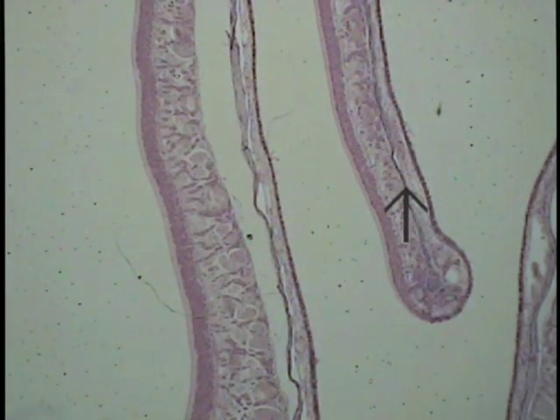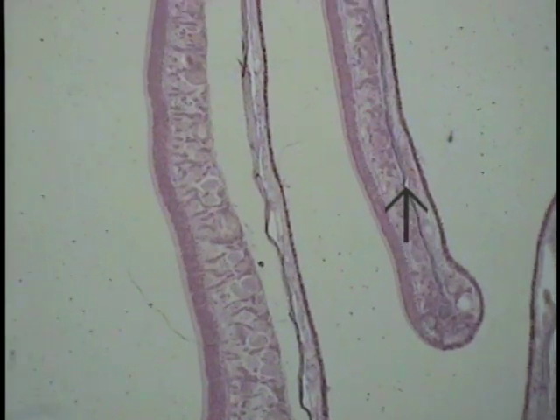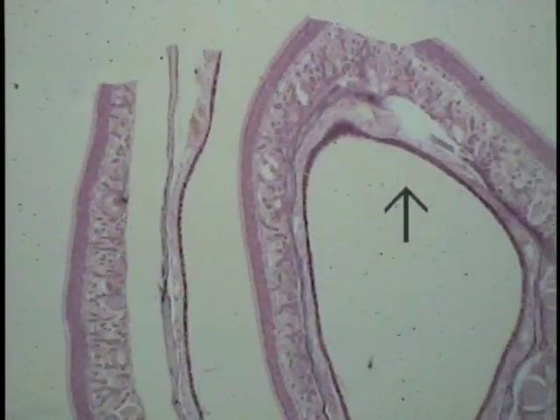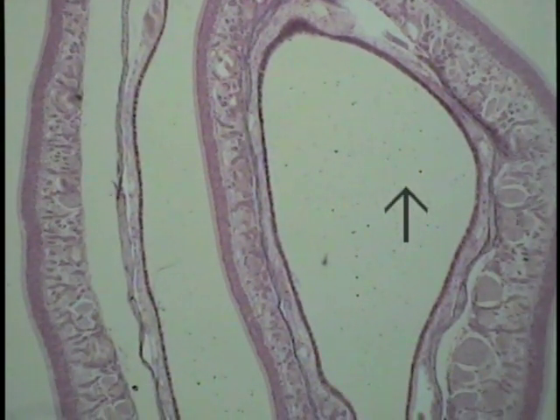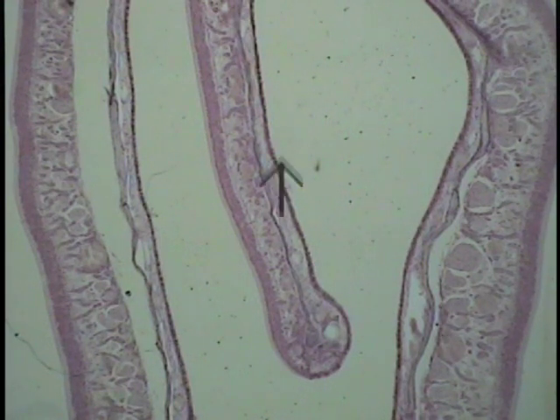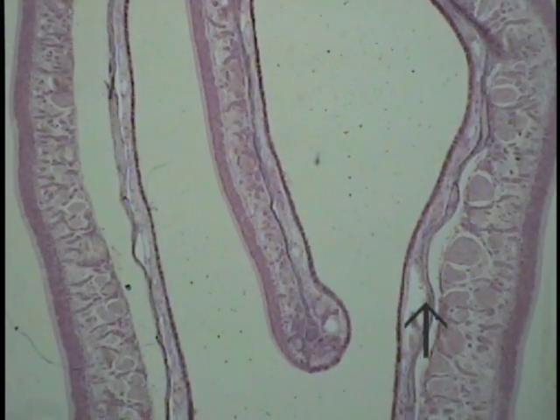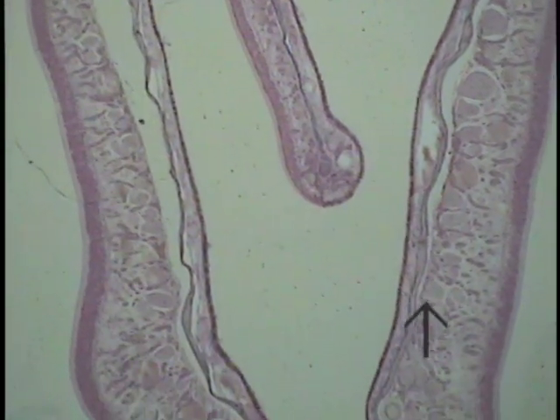And this is a cross-section, so you're looking at it sort of head-on as if looking into the nasal cavity. So it's wrapped around in scroll-like fashion. The heart of it has this very thin, paper-thin region of bone that provides the support for this particular structure.